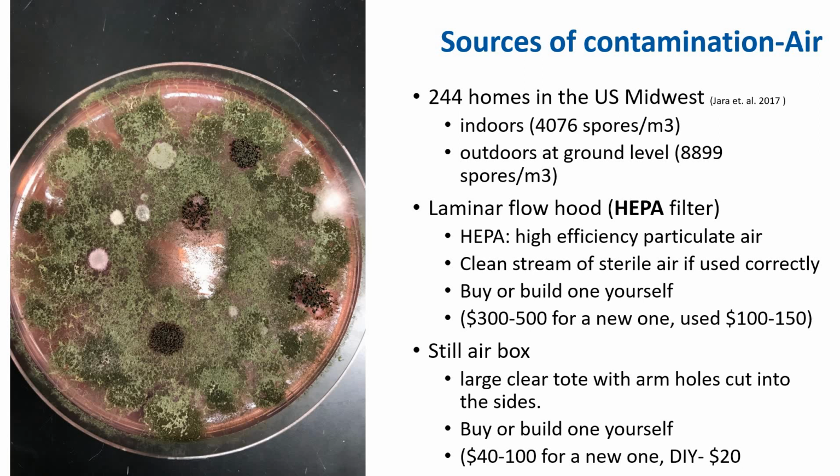So, how would you solve the problem of the air as a source of contaminant? The best option to reduce contaminants in the air is to use a HEPA filter. A HEPA filter is simply a box containing a fan that pushes air from the back through the paper-based filter and then to the front of the unit. As you sit in front of the HEPA filter, filtered air is blowing toward you. If the housing of the HEPA chamber is designed in such a way that the filtered air flows in a linear direction toward you, this is called a laminar flow hood.